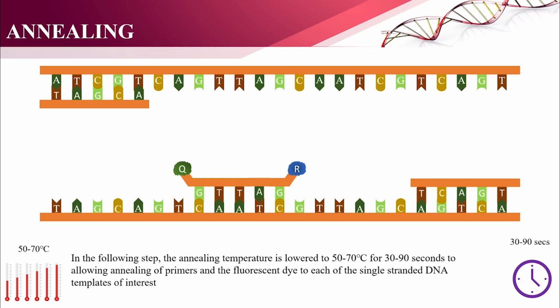In qPCR, a fluorescence probe such as TaqMan or Primer-based probe contains a fluorescent dye. At one end is a quencher and at the other is the fluorophore. The quencher suppresses the dye fluorescence through non-radiative energy transfer, preventing background signals.